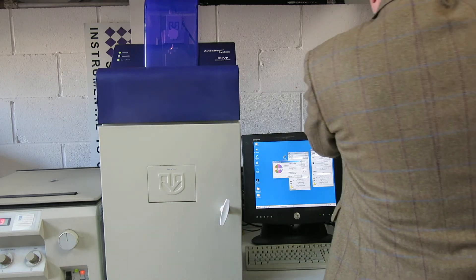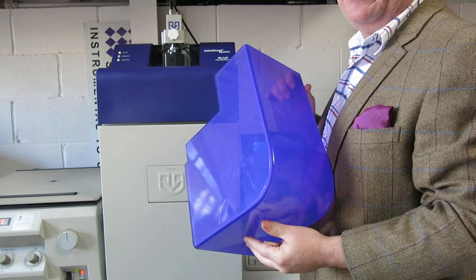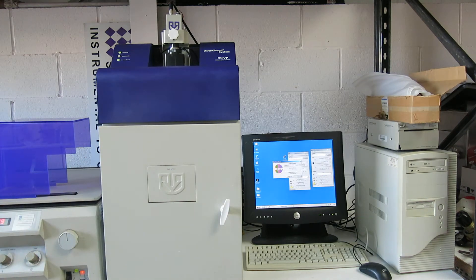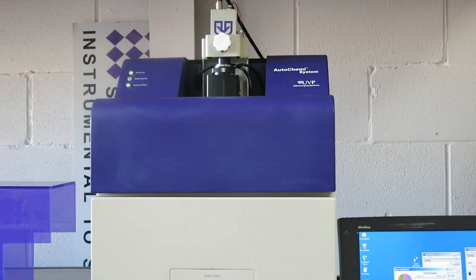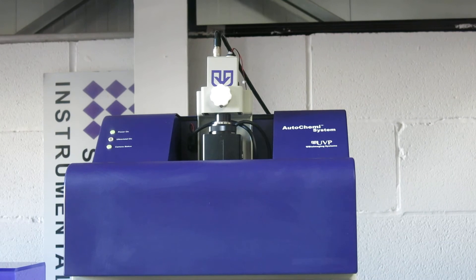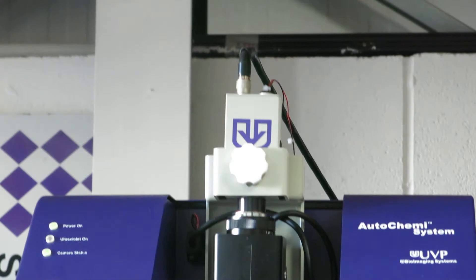That's all in this box. If we have a look at this here, you can see there's the camera attachment on the top of it there — hopefully you can see that. Just have a quick look at that — we can zoom in on that one there, and that's the camera attachment on the top of it.